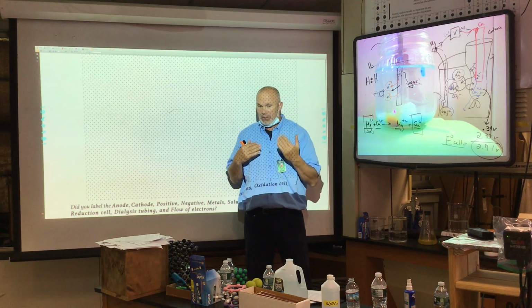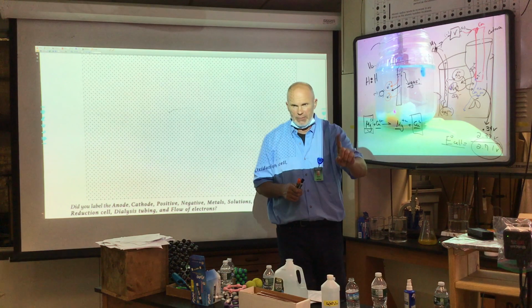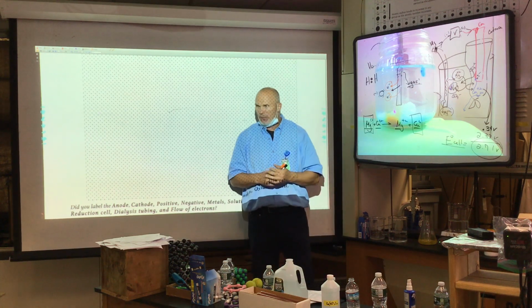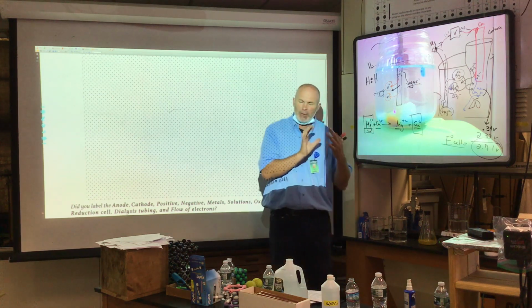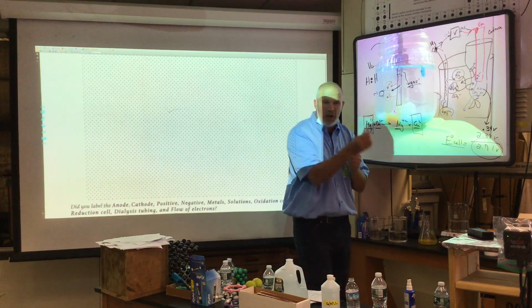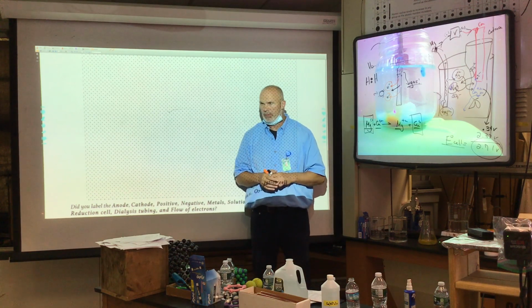The first thing I would do is say, hey, and by the way, that percent error should not be positive. Because our experimental voltage that we measured was under what we got from the net potential table, I expect you to report a negative value.